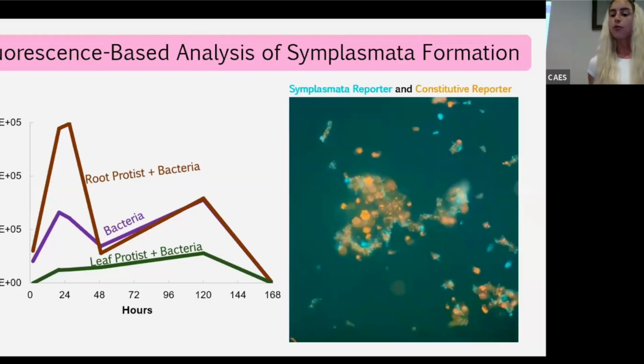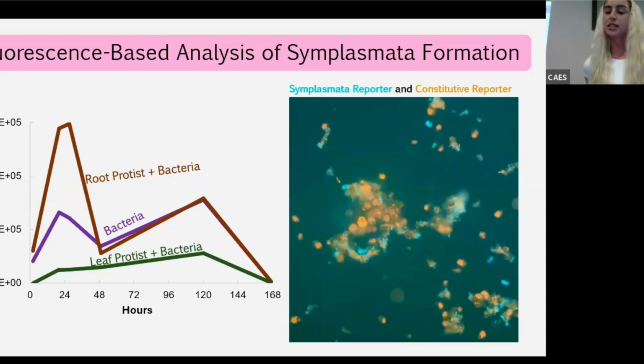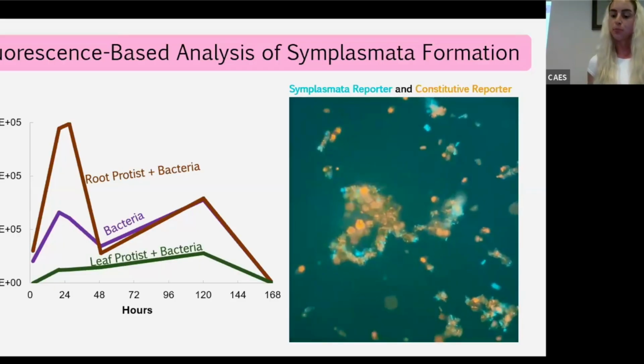I recorded this video to show the leaf protist glowing from ingesting the bacteria and how none of the symplasmata were able to be consumed by the protists.